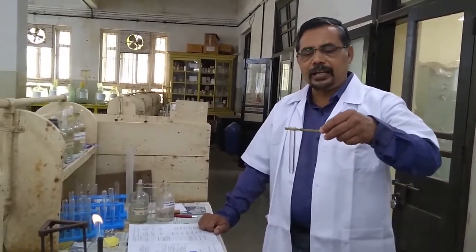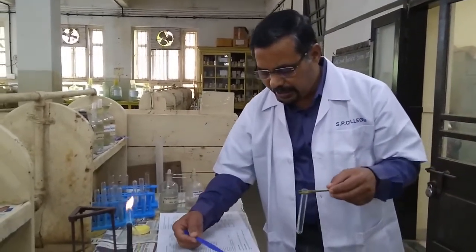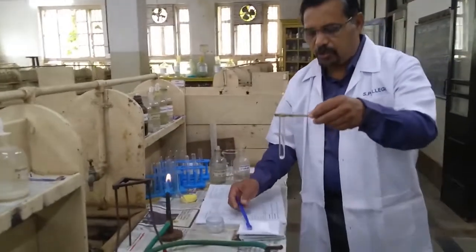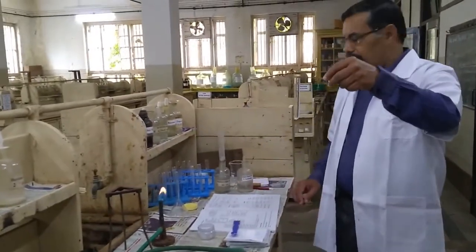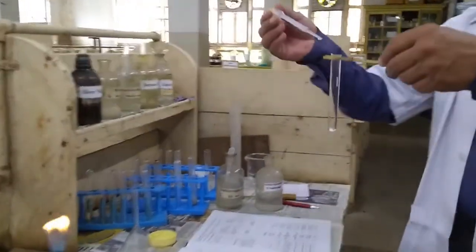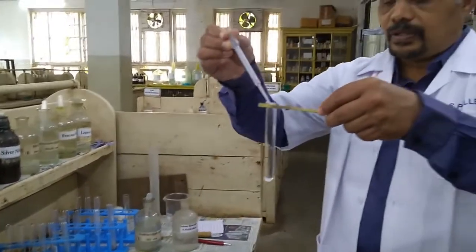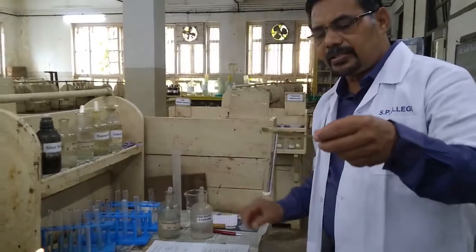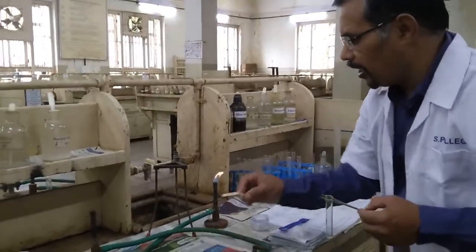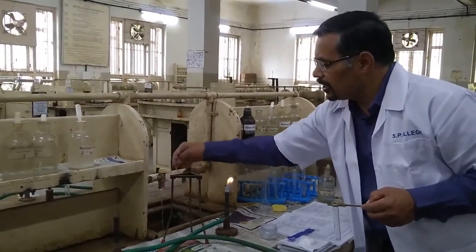So the test is again action of NaOH. So for this test I will take a small quantity of the mixture of these salts in the given mixture. Then I will add a small quantity of NaOH in this. Then I will heat this mixture and I will test with turmeric paper. Before this I will make this turmeric paper moist.